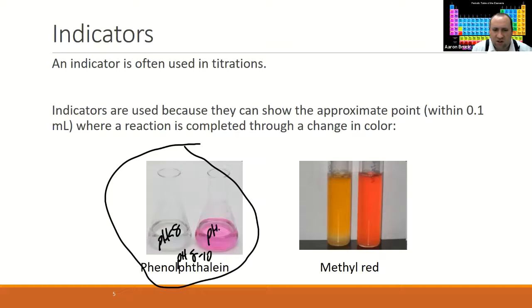At pHs greater than 10, we see it in a darker version. And in the range in between, we see kind of an intermediate rosy color, where we do see some coloration, but it's not nearly as strongly pronounced. And that's ultimately what we're shooting for, that in-between zone.